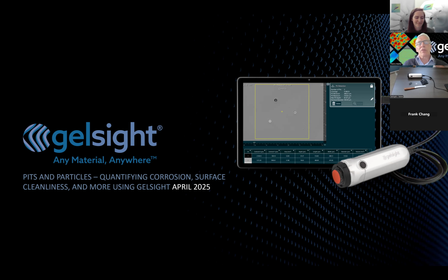In the second part of this webinar, we address particle counting and sizing, which are also very critical for different applications, from additive manufacturing processes to, as I was mentioning, rating the cleanliness of components in the space industry, for example. Cleanliness is critical in the space industry. The presence of particles can significantly affect the lifespan, and even cause the malfunction, of a spacecraft system. I have in mind, I think it was in the years 2000, the loss of a satellite simply because there was a leak of propellant, the thruster propellant, which was due to a particle. So cleanliness of components in this industry is really key.